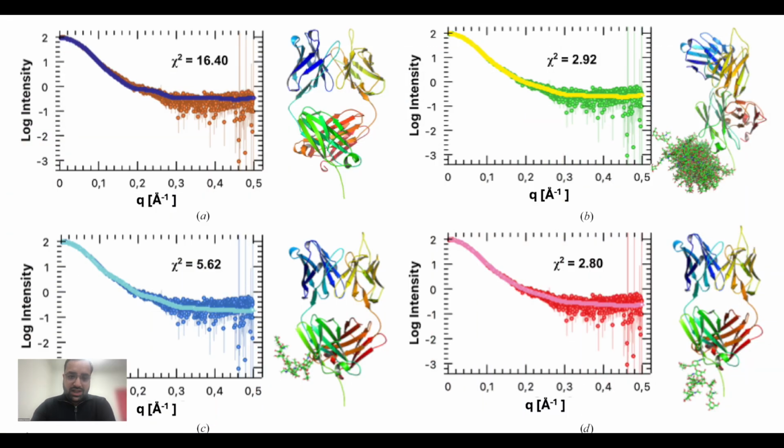And then after that, we put it on the SEC-SAXS using MultiFoXS and FoXS analysis, as was explained in the paper. With that, we were able to see that our scores went way better with some models compared to others. So that was the standard protocol that we followed to identify that these glycan conformations were much more suitable, and qualitatively much better and closer to our native structure compared to the others, where the score fell off through the roof compared to the ensemble.